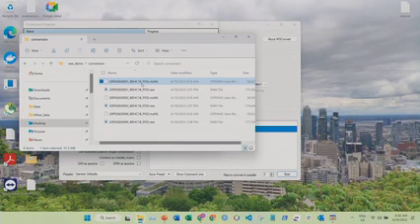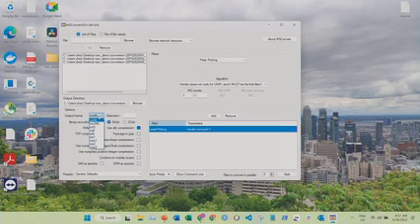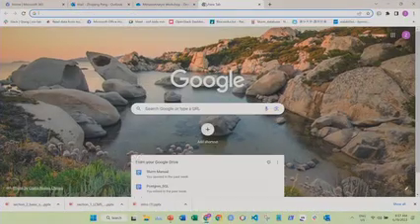This is critical. If you don't do the conversion or centroiding, the data will be gigabyte level, so you cannot upload or transfer easily. This is the first step I want to emphasize. You can also select different formats from here. It's up to you. We support different formats.